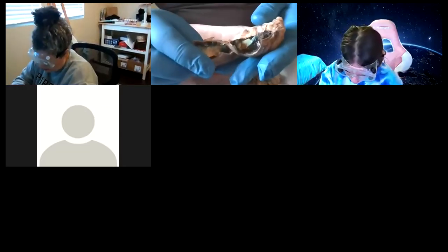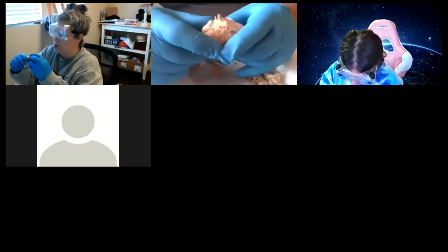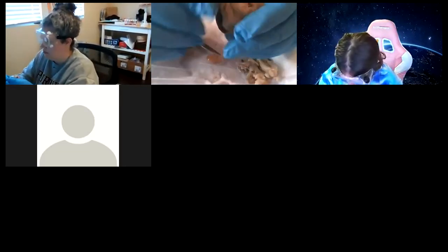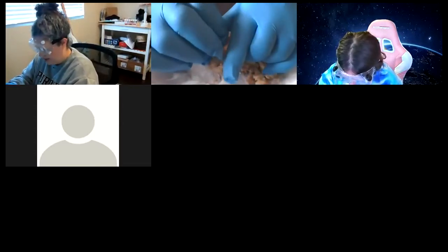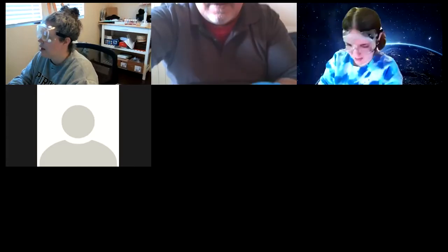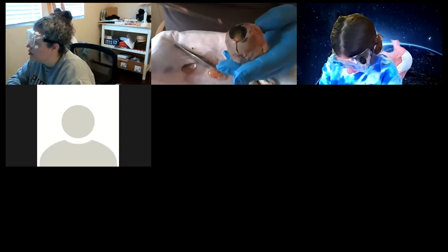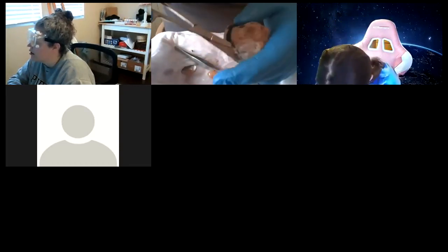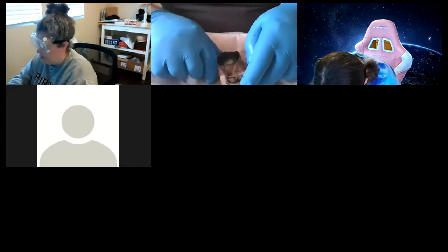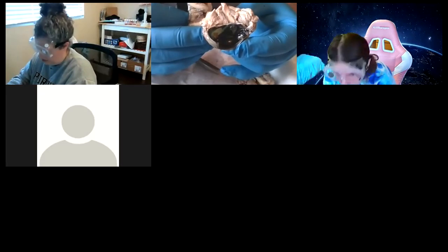Finding the optic nerve is important, Sarah. See if you can find it — it's directly behind the cornea, on the back. What you can do is look at the cornea and then go to the back. I started from the cornea area, cut like this, and I found it hard at the end, so I took my scalpel and cut the rest. I cut it so that the optic nerve was on one side — that came out really good, actually. We should screenshot this because that's a really good cut.